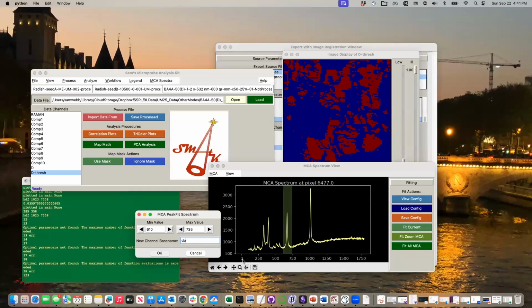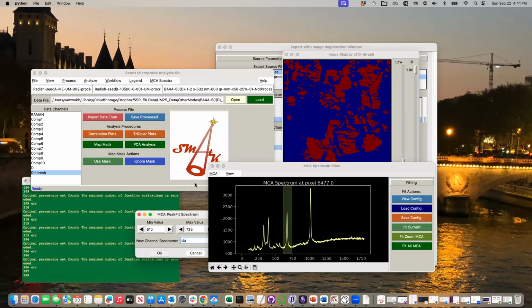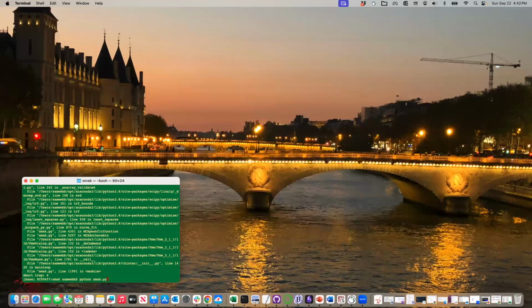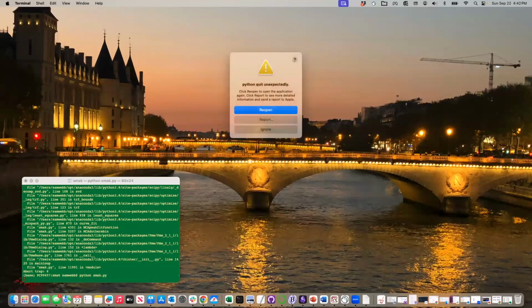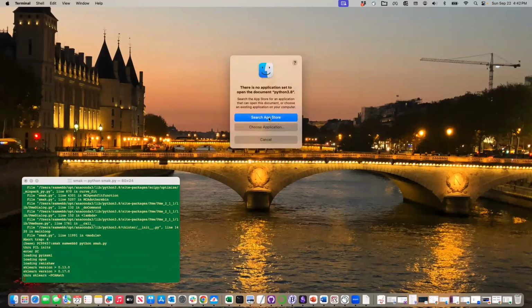It's not going to like me because I think I fit this in bins and not in wave numbers. This is going to take far too long. I did the wrong thing. I believe we wanted the active, not the other one. What I will say is it looks like this. Yes, we know. No, don't need to search.